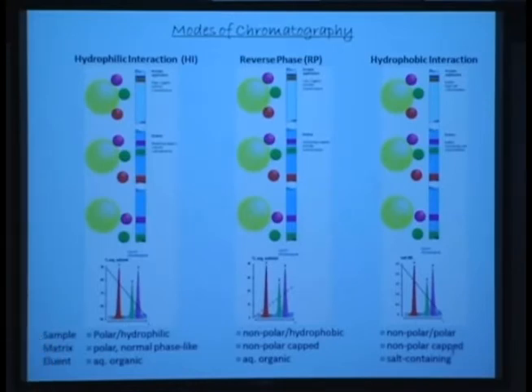Under normal conditions, the matrix, silica or other polymeric matrices, typically have hydroxy groups, typically have polar groups. These polar groups would then interact with hydroxy groups of the sugars, and you would generate interactions under appropriate conditions. The appropriate conditions are for interaction of hydrogen bonding, or likewise a little bit of ion pairing interactions.